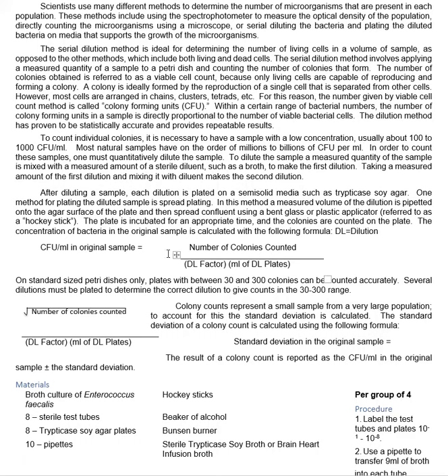So I stir this up very well, and then I take a sample from that one and put it in the next test tube. Now, I'm only going to move 1 milliliter of fluid from here to the next test tube. So of that 1 milliliter of fluid, 1/10 of that is the original bacteria and the other 9/10 is the fluid. So I'm taking 1/10 of 1/10, and that is 1/100th or 10 to the minus 2.